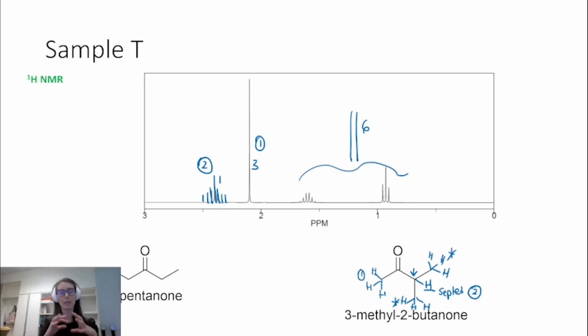I really like thinking about different structural isomers from the same molecular formula to confirm that you have identified the right molecule whenever you're in a situation where this might be aligned to grades. What we use it for personally is to double check that we haven't made the wrong molecule in the lab. So it's really good to think about other molecules that could be similar and think about their NMR spectra and then discount them based on the NMR spectrum that you actually do have. I hope you find that kind of approach helpful for validating that you do have the right molecule.